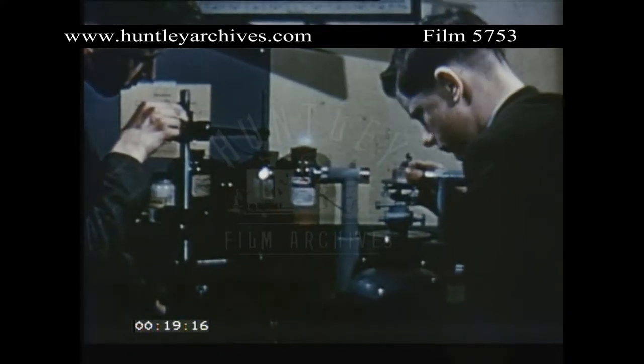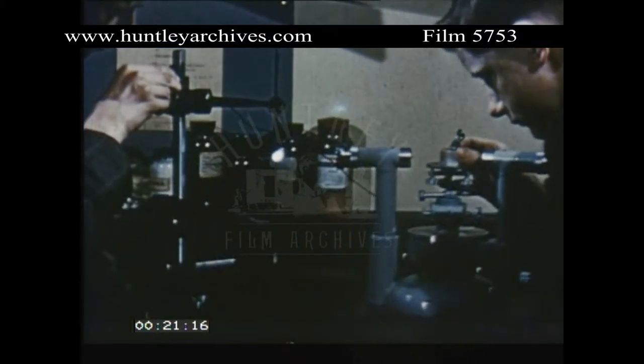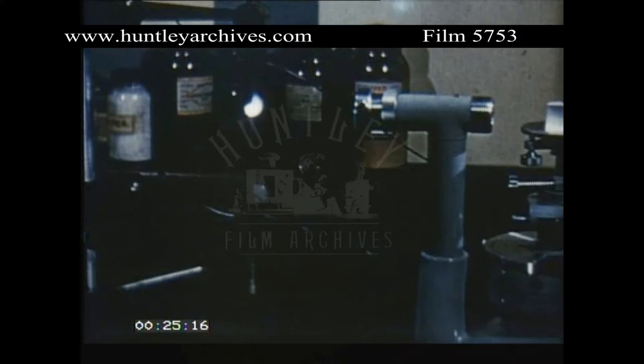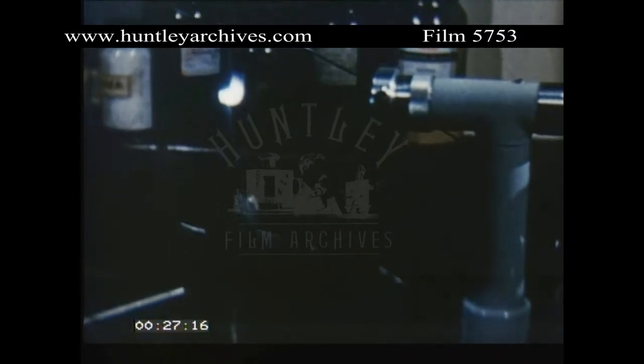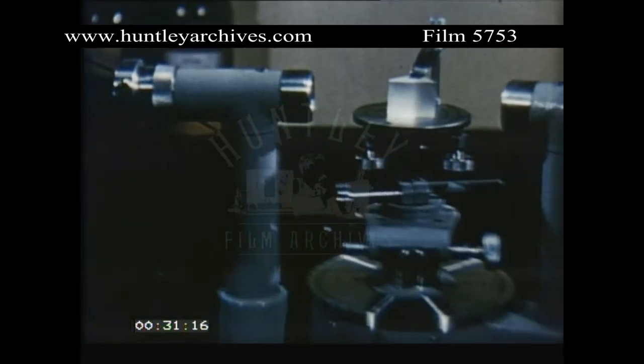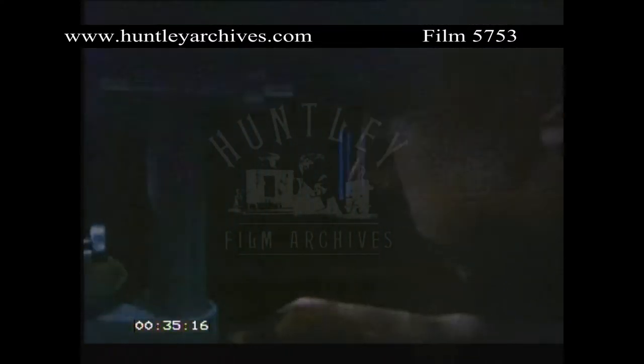This is the simple school spectrometer. From an arc struck between two copper electrodes, light passes through the collimator, prism and telescope, and is converted into a copper spectrum.